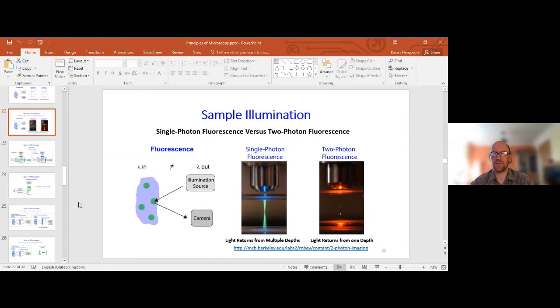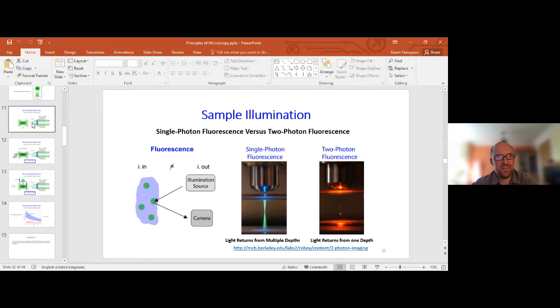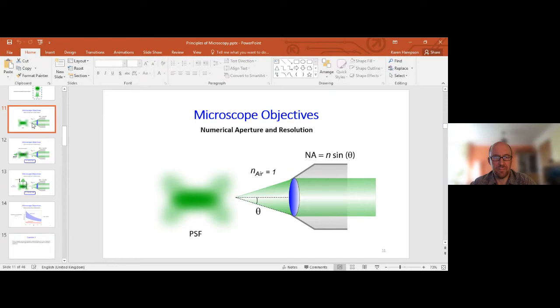Okay, why is the axial resolution greater than the lateral resolution? I think the simplest answer to that is to do with the nature of the physics of focusing. Because, as you can see in the diagram, the focusing angle is narrow, and you have this focusing cone, the nature of the light concentration means that it is elongated more along the optical axis than it is laterally. If you were able to design a lens which actually illuminated from all angles, so as if rays were coming in from every direction in a sphere, then you would have an isotropic point spread function. It would have spherical symmetry. But lenses aren't like that in practice. We have to focus through a focusing cone. The rays go through a cone, and therefore we end up with a focal spot and point spread function which is elongated along the axis.